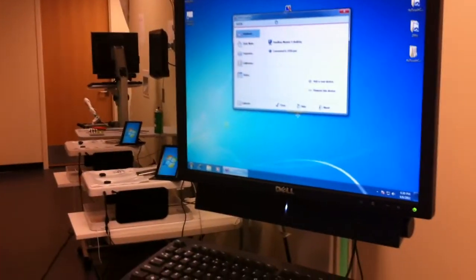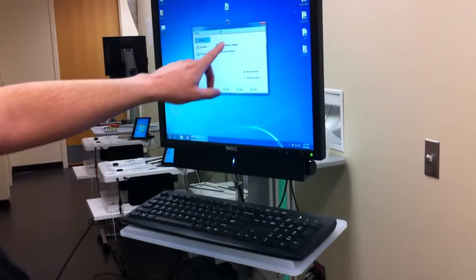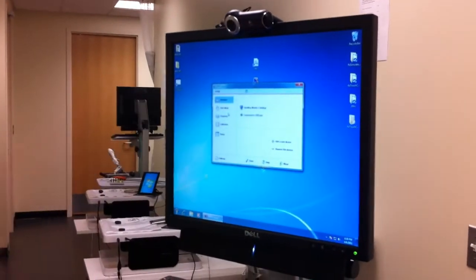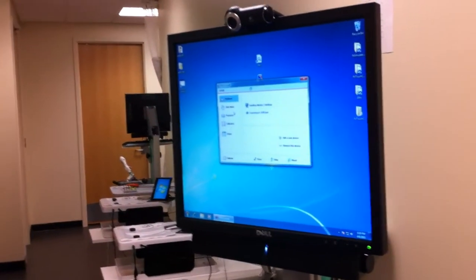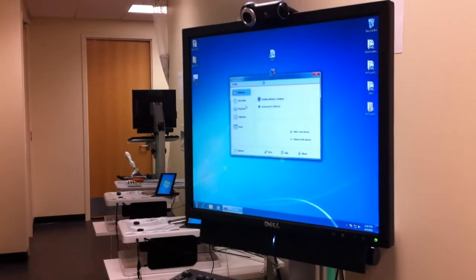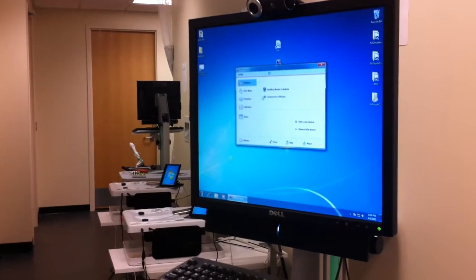Okay, one more device. We now know it's the one at the far end on the right. So we're going to choose it here, drop this down, choose SJT4, which is the last one in the list. Again, that list is randomized every time the computer starts. So basically you just go through each one. You don't have to start with SJT1, just go through them top down. We're on the last one.